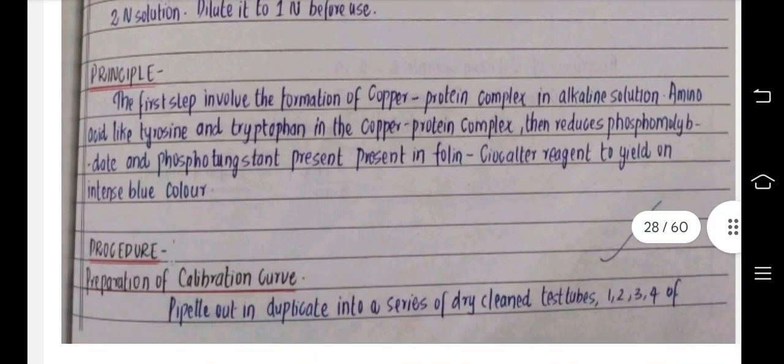The first step involves the formation of a copper protein complex in alkaline solution.